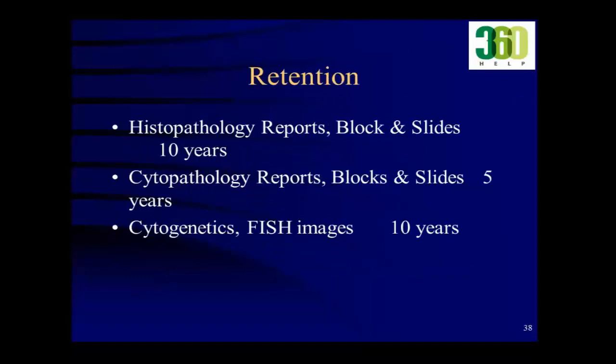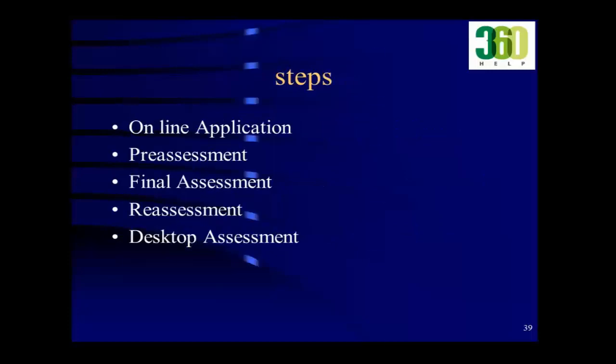Two or three things which are very important, as you all know: the retention of histopathology reports, blocks, and slides for 10 years, cytopathology for 5 years, cytogenetics and FISH images for 10 years. So all these guidelines you are supposed to follow.